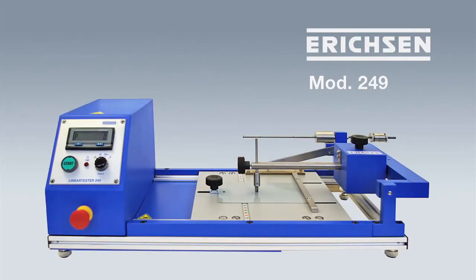The Linear Tester 249 is one of the most multi-purpose testing machines ever. It is adjustable within a huge range of test forces and speeds. It is also able to apply single scratches as well as an extremely large number of adjustable to-and-fro double stroke testings.